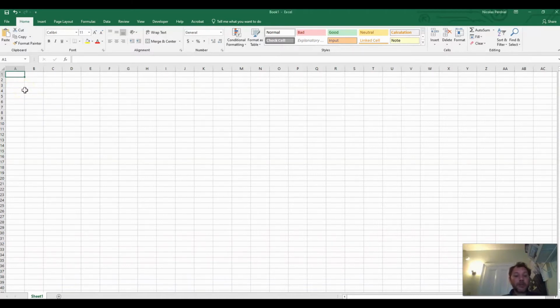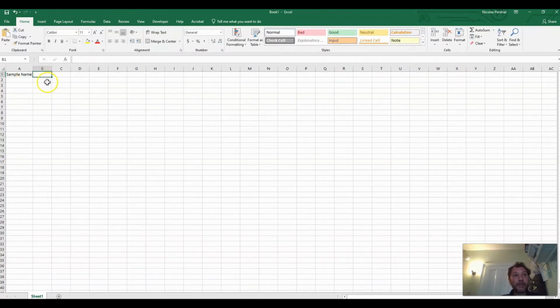The columns that we need are about 7 columns, 7 different pieces of information. We're going to start with a column with the sample name. For later, because we will need it, and it's always interesting to have this information, we will also record columns for latitude and longitude.